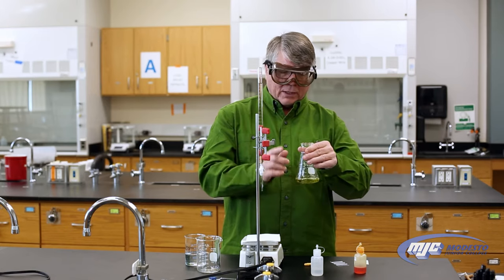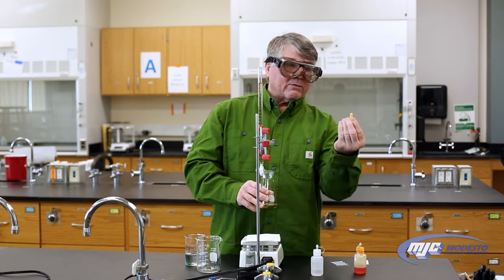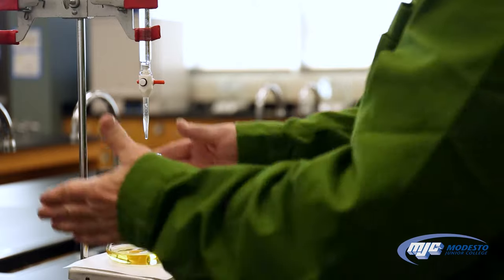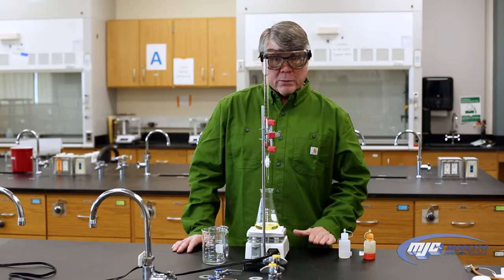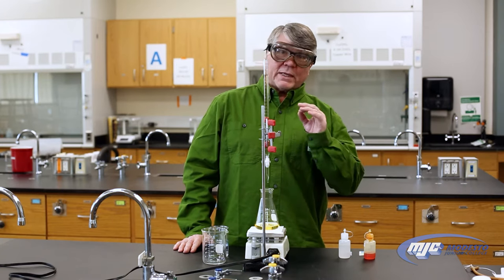Once I have that, I'm going to take my Erlenmeyer flask with the unknown acid and the bromothymol blue, add a magnetic stir bar, and put it on the stir plate, which we have directly beneath the burette. Now we're ready to start the titration.